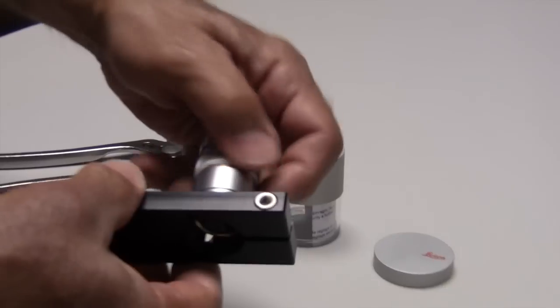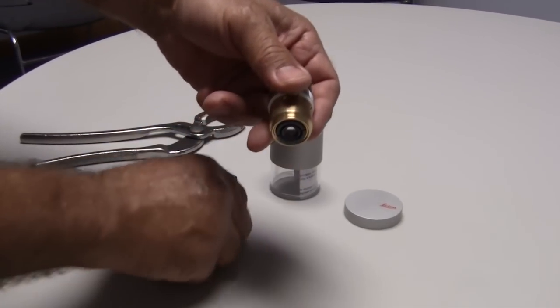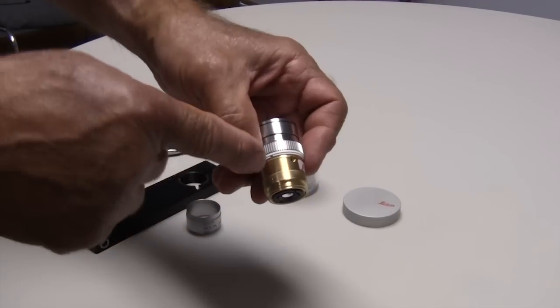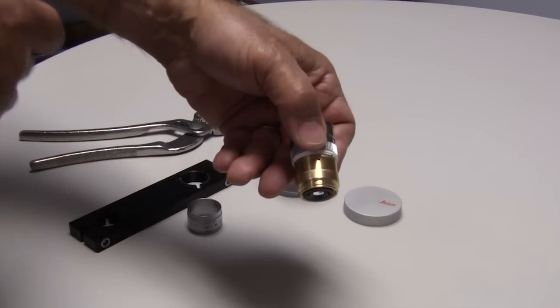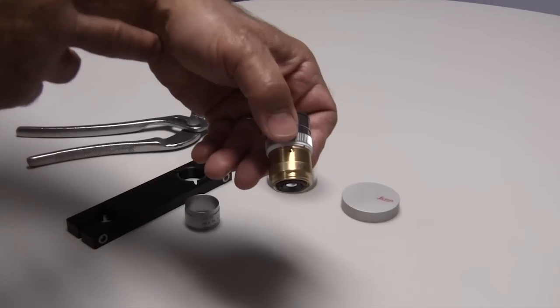Then we can unscrew the objective and remove the sleeve. Now we have direct exposure to the brass surface of the objective where we can transfer heat either into the objective or away from the objective.